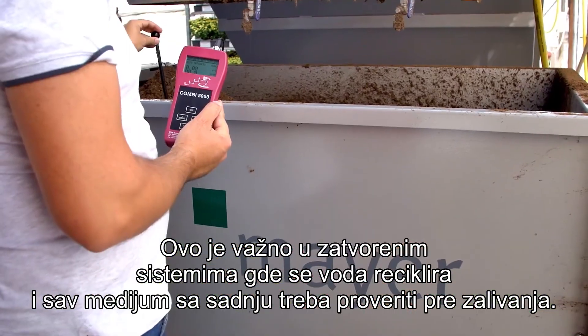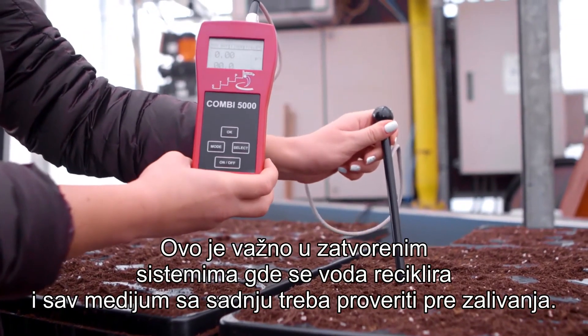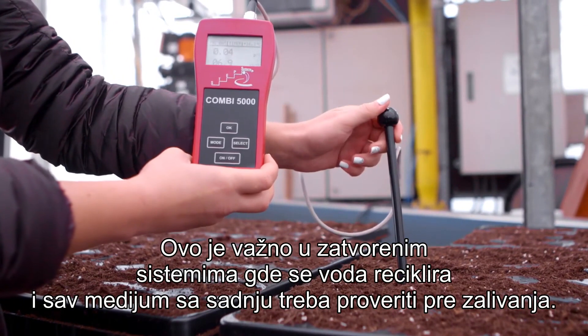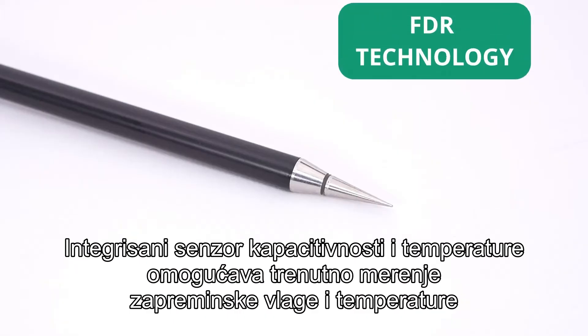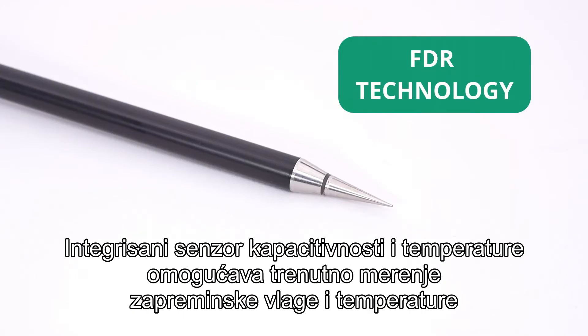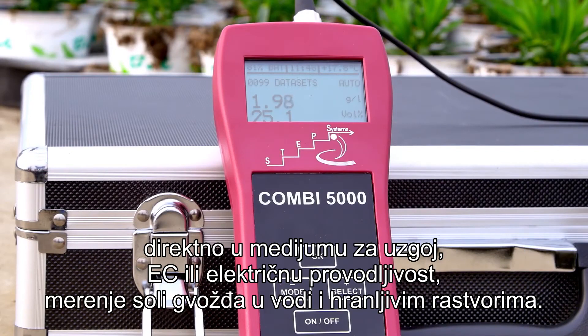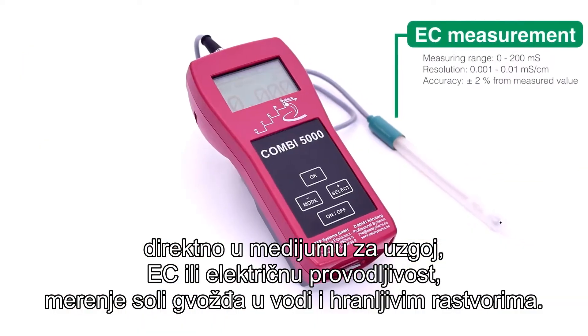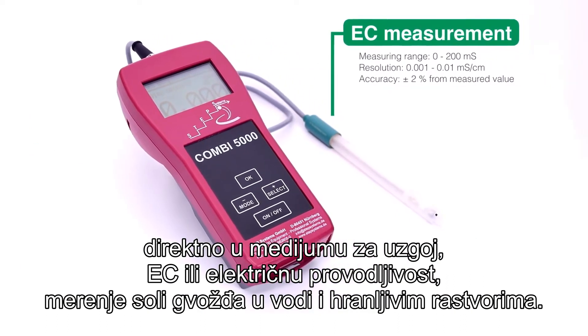This is important in closed systems where the water is being recycled. All growing media should be checked before potting. The integrated capacitance and temperature sensor allows for the immediate measurement of volumetric moisture and temperature directly in the growing media.